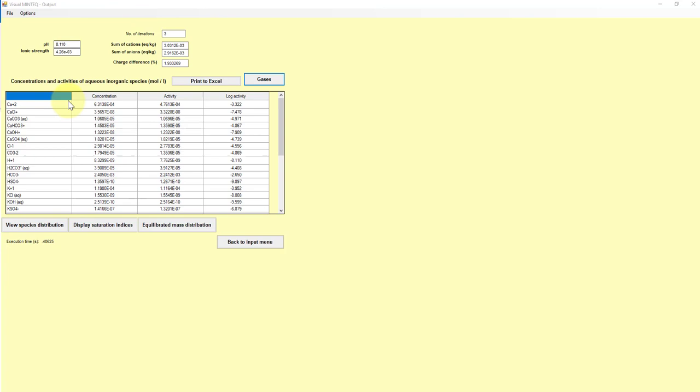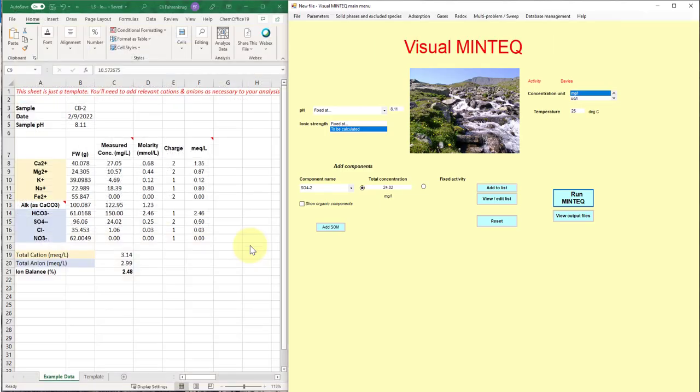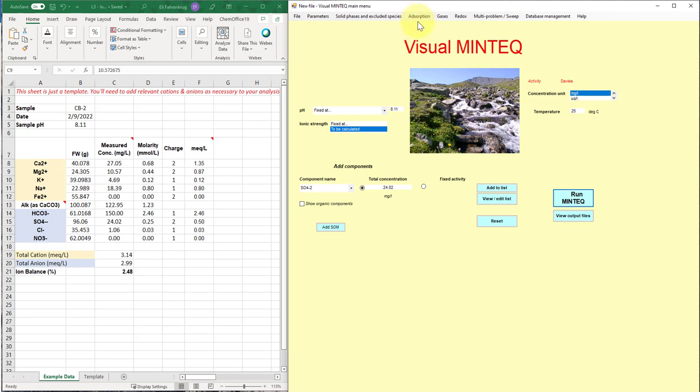Okay, so that's where we're going to leave it. Of course, there's lots more information that this software can provide for you. So I encourage you to play around with it. There's a lot of more advanced models for speciating based on redox. So looking across oxidation states for systems and also modeling sorption or different gases in the atmosphere. So there's a lot of possibility with this software, but for ion balance, this is what we'll use it for.